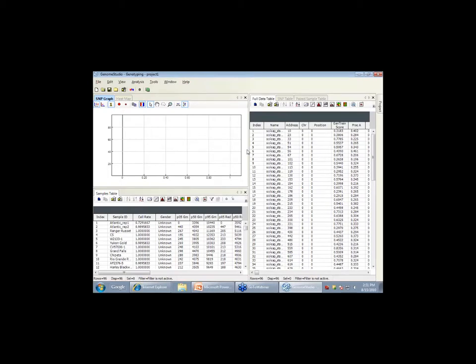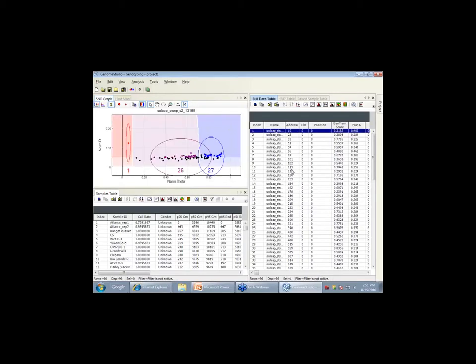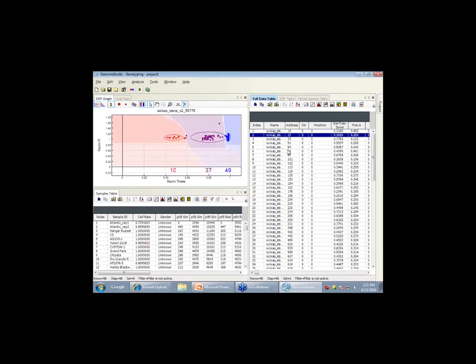So one of the first things that you want to do is really define the clusters. And what a cluster is, if you just click on any one of these. Let's click on number 1, the top window over here. That's a bad example. Let's click on number 2. And what the software does, it color codes the clusters, basically where it thinks the genotype classes are.